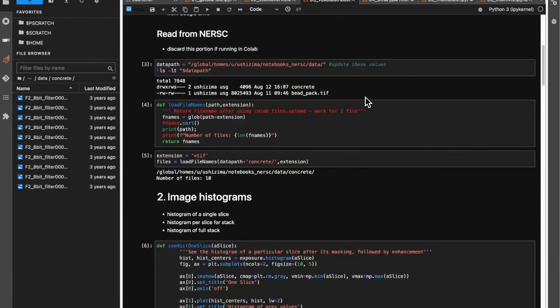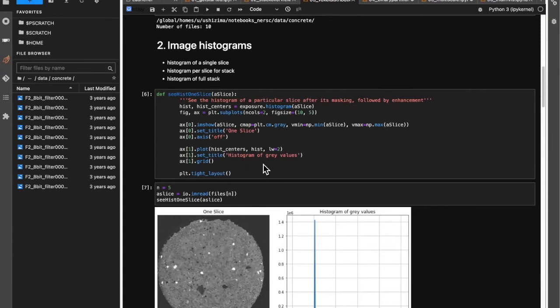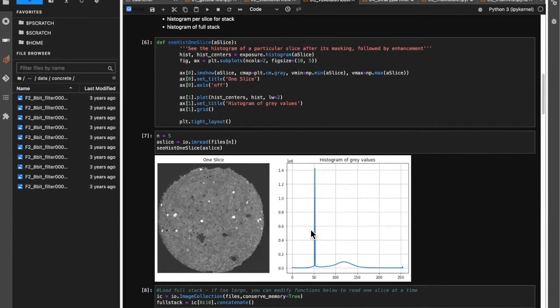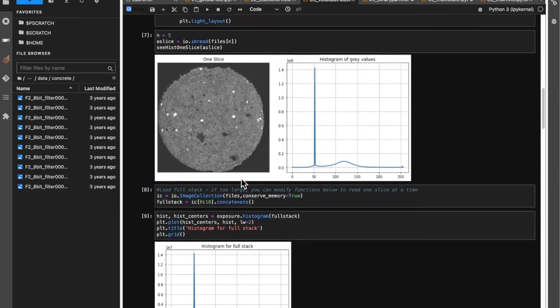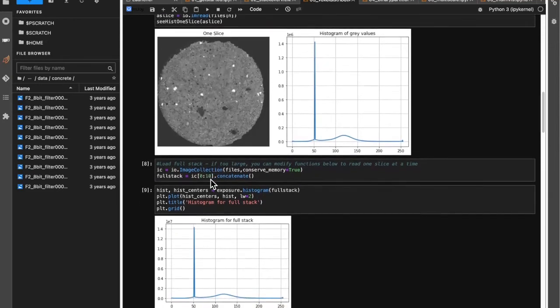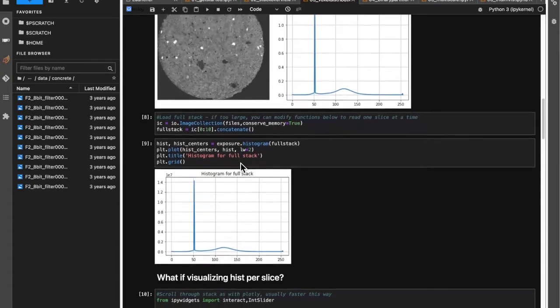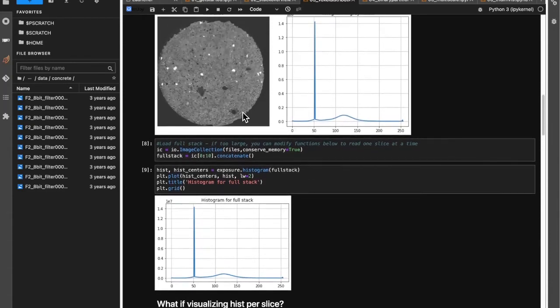Now you know how to load the data. Here are the histograms of images. I designed a function so that not only can you see the histogram, but also the slice that corresponds to it. Instead of using a random number, I'm assigning it by hand. Using this function, I have access to that. I want to emphasize here that we're using scikit-image, the module exposure, and the function histogram. Next, I'm using the image collection to read the whole stack, concatenating every single slice from 0 to 10 of that stack, and then plotting the full histogram. You notice that the histogram of the full stack is very similar to the individual one.